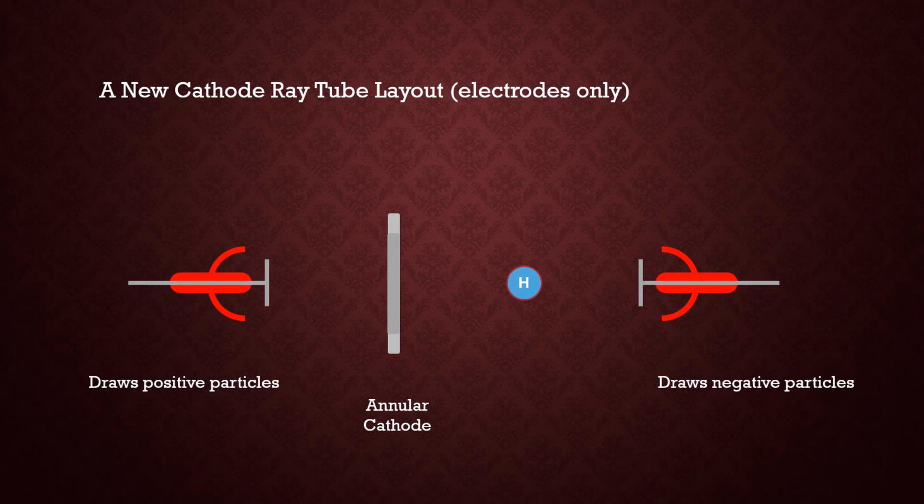And so what you do is you create the electron beam, strikes the neutral species, creates an ion, positively charged, which gets directed in the opposite direction of the electrons. So now, if you put the analyzing electrode plates, in other words, the E field and the magnetic field plates parallel to the trajectory, you could measure the charge to mass ratio of the ions.